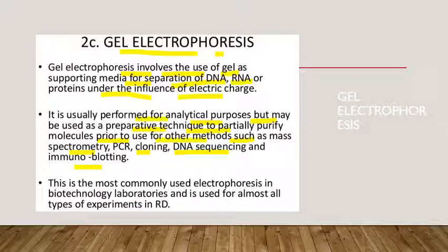So for purification also this method is frequently used, in which the gel is used as a supporting medium or stabilizing agent. This is the most commonly used electrophoresis in biotechnology laboratories, as well as for almost all types of experiments in research and development.